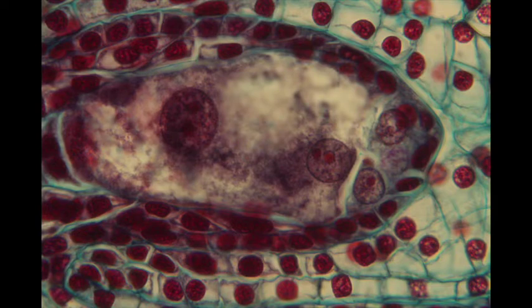And now we can see the 8 nucleate stage. So on the right there we can see 3 cells. The one that's kind of blurry in the apex, that's the egg. Then if we go back in the main part, we can see 2 larger cells there. Okay, those 2 then are going to be our polar nuclei.